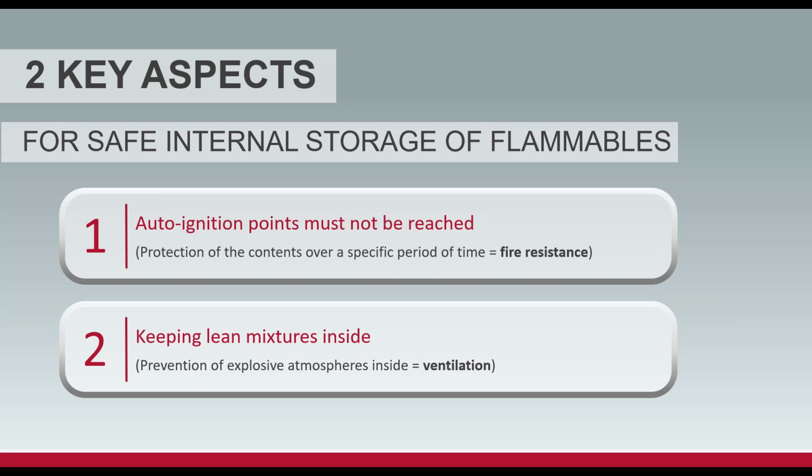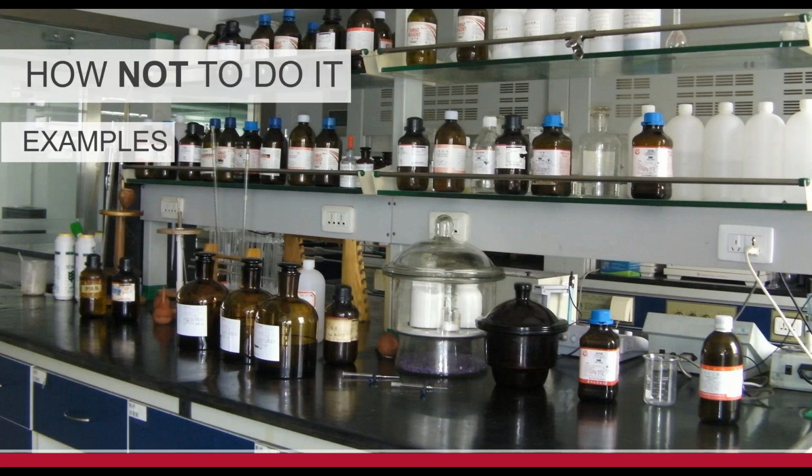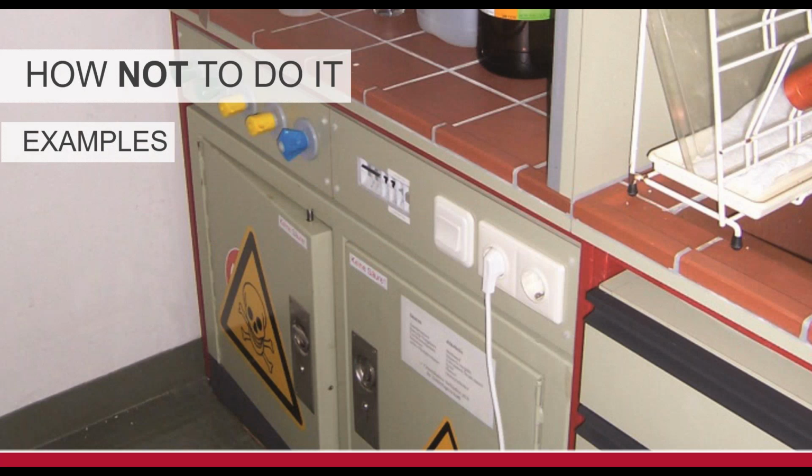Number two, to prevent explosion or overexposures, we've got to ventilate those two processes. So, examples of how not to do it. Due to our time, I'll go through these really quickly. I showed the video that was kind of a joke, but here's reality. These are just videos we talk about.